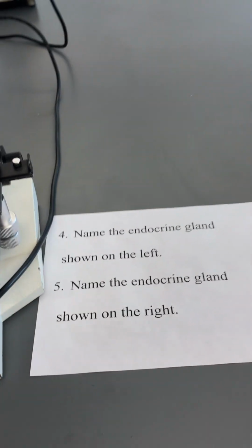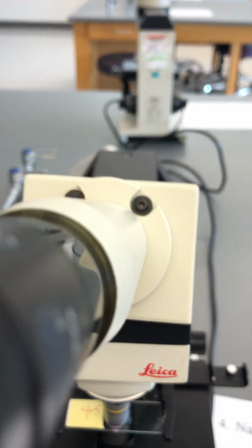Okay, number 4, the endocrine gland on the slide is the pituitary gland. On the left is the anterior pituitary, and on the right is the posterior pituitary.